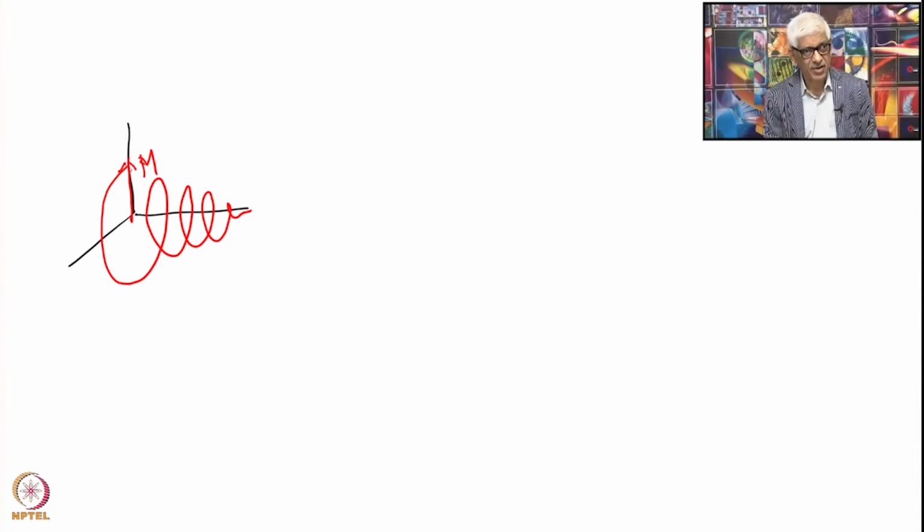So the magnetization which was here initially, this was my M. The magnetization will go like this, and eventually it will come here. So this is the way it will move, right. In the long run, when you give enough time for the field, the magnetization to adjust itself, it will come to the axis of the H1 in this manner.